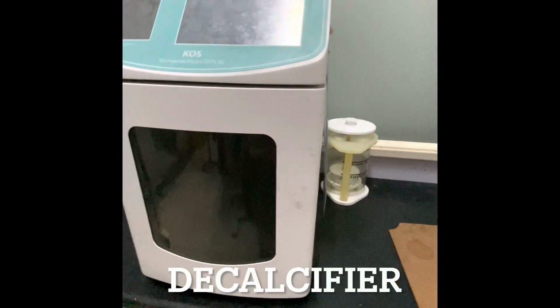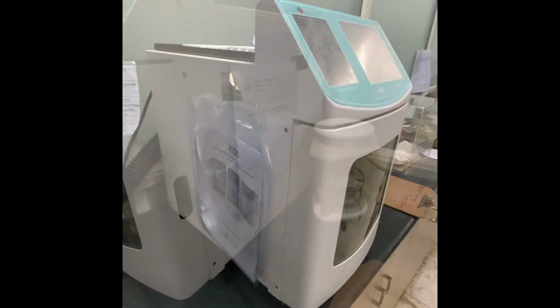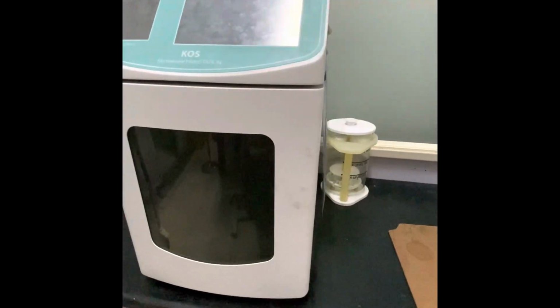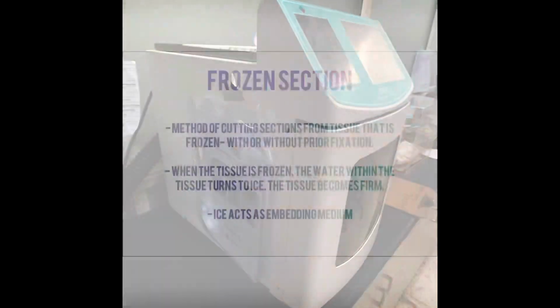This is a decalcifier that is responsible for decalcification. For the microscopic examination of calcified tissues, it removes calcium salts from the mineralized tissue, resulting in preservation of organic components.